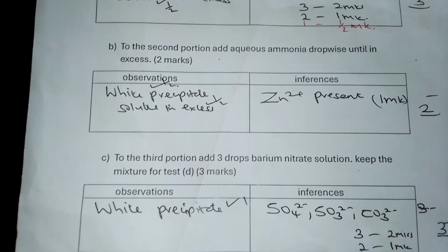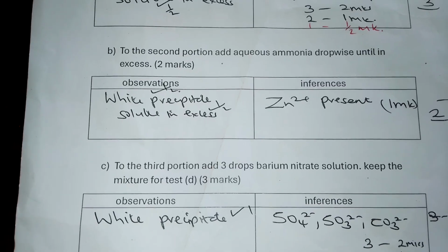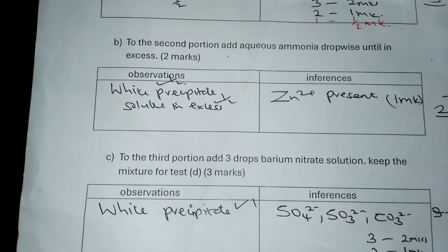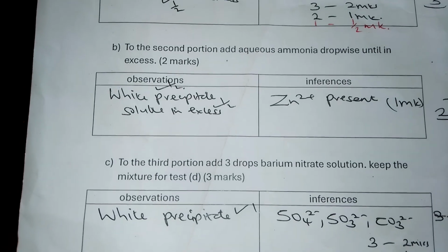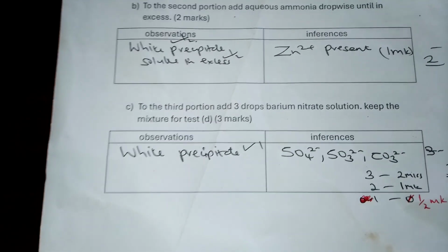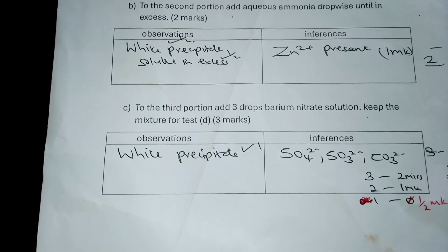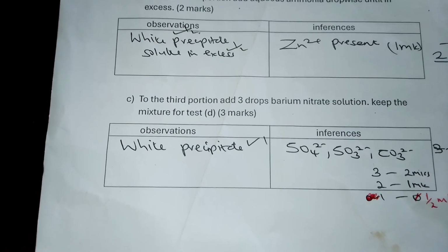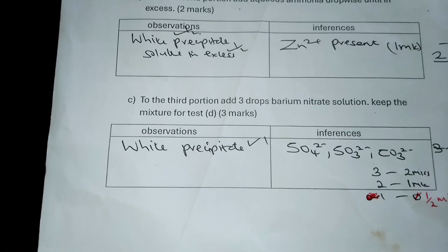We went ahead to the third portion, and we added 3 drops of barium nitrate solution. The procedure says to keep the mixture for test D, 3 marks. Then we found a white precipitate, and we concluded that sulfate ions are present, also sulfite ions, and carbonate ions.